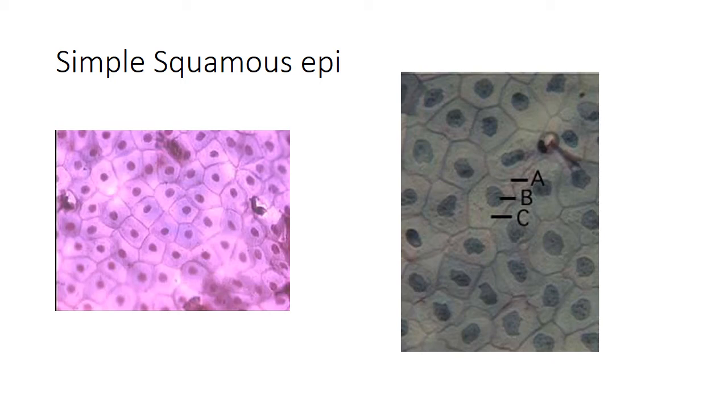So let's do a little reviewing for the lab practicum. Now, lab practicum, you're going to see some slides like this, and all you have to do is identify them. So we'll do some reviewing, and then also there'll be some really basic questions about tissues that you should be able to figure out. And it'll be timed. It'll take you 20 minutes. If you guys are really in lab, it only takes 10 minutes. It's pretty quick. So 20 minutes is more than enough time.